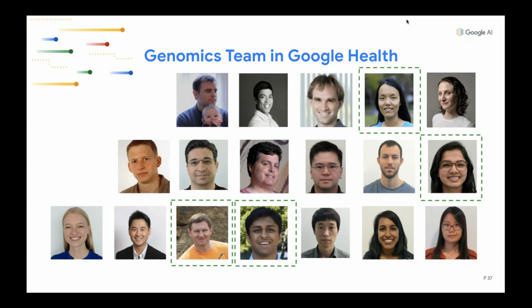Yeah, so this is a very good question. We're starting to get into this. We conducted an investigation last year where we looked at mosquito genomes, and we found that DeepVariant performs much better when we retrain based on pedigrees in the mosquito genome. So the human genome structure looks different from the genome structure of other organisms. That's with respect to genetic diversity, which is much poorer in humans, as well as with respect to potential differences in ploidy and segmental duplications.